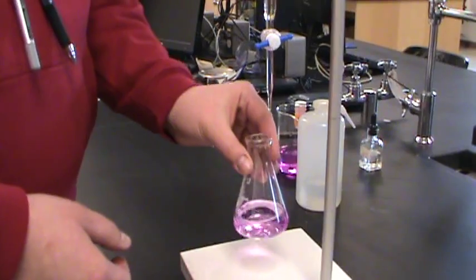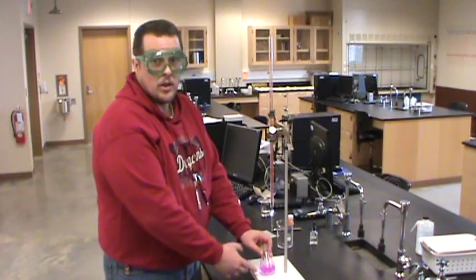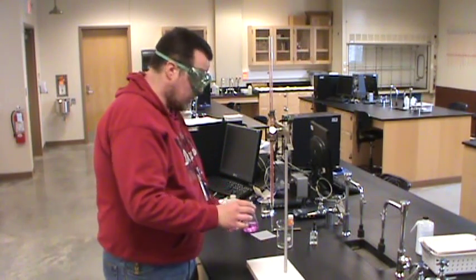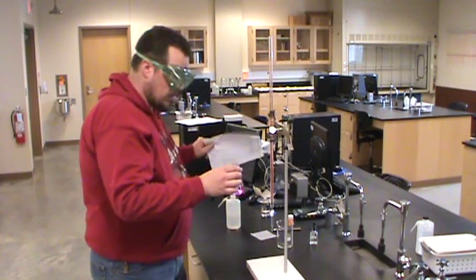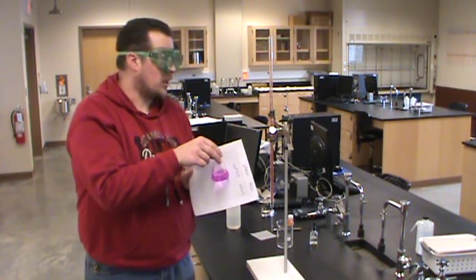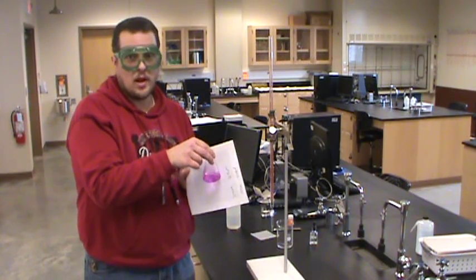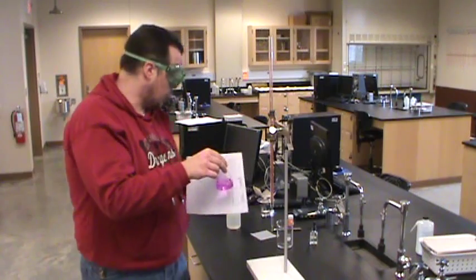So now I can take my final reading. You can see I've got a persistent pink endpoint now in my solution. So I've reached the endpoint. I've reached the place where I've added the same number of moles of sodium hydroxide as potassium hydrogen phthalate.